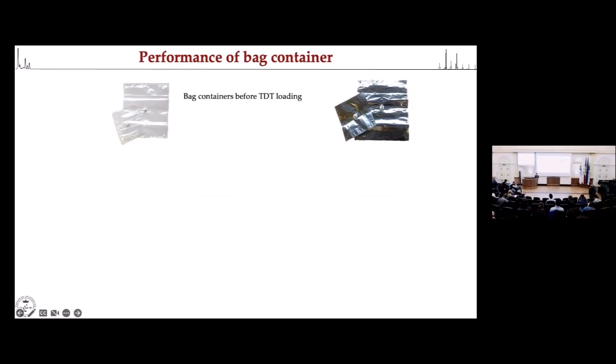So we start with the sampling. Of course, I will talk about offline sampling of breath, because I want to show what we do then with GC×GC, and there is no direct infusion on a GC×GC system yet. There are many ways to sample breath offline. The most common involves the use of a temporary container, a bag container. And after that, usually the volatiles are trapped in thermal desorption tubes and then desorbed into our GC system. These bags can be made of many materials.